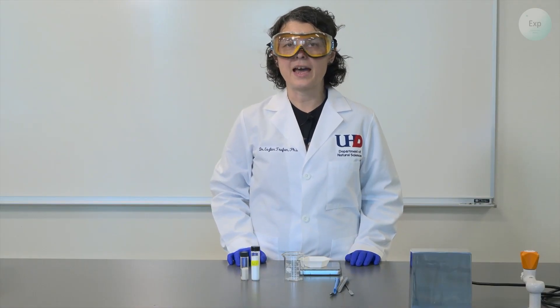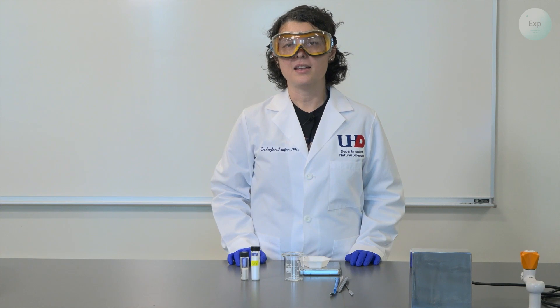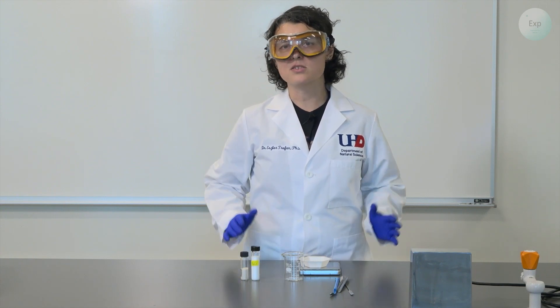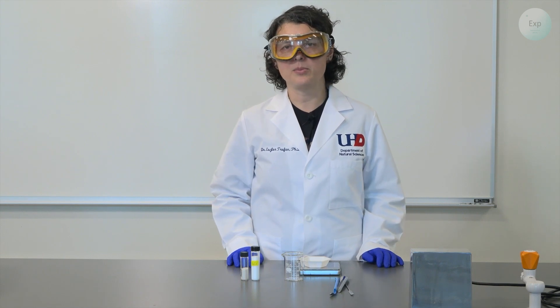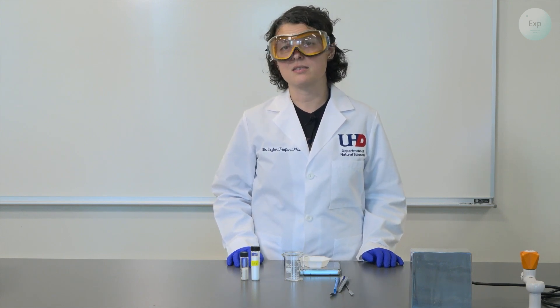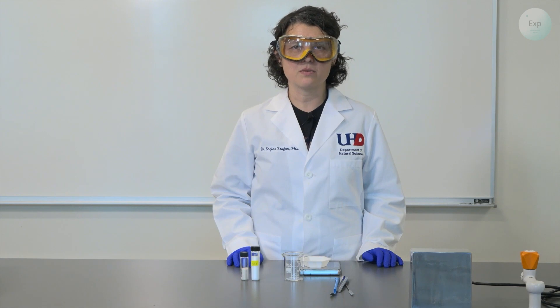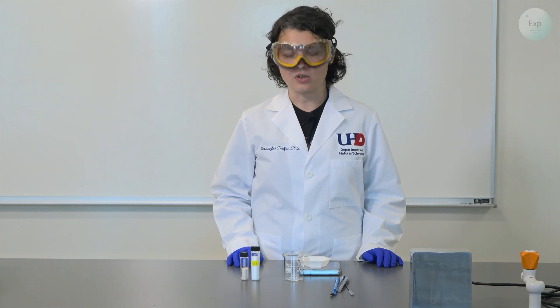Of each of these, we will weigh out approximately five grams and we will record those masses, as those are currently approximations. If it is 5.05, that's acceptable. If it is 4.87, that's also acceptable. Just make sure that you record it exactly as it appears on your scale.